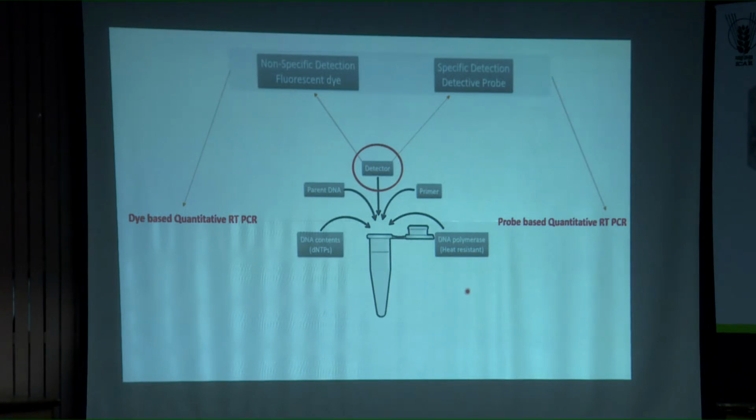If you ask me which one is so important in PCR, can you figure out relatively which among the 6 or 7 ingredients is so crucial? All are important, no doubt. If you miss any one, the PCR will not happen.